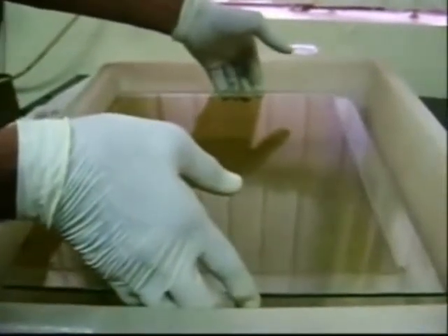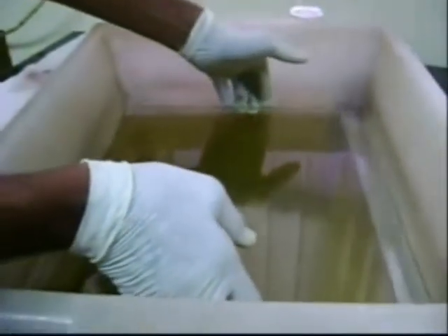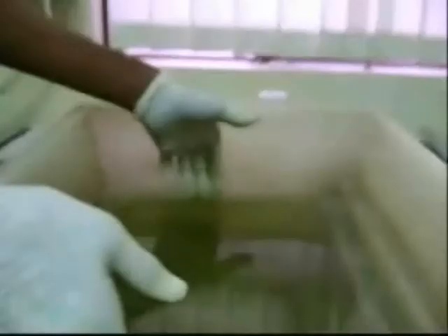Then keep the plate in fixer or stopper solution for 5 to 10 minutes. These are the banding patterns of SSR markers obtained after silver staining. SSR markers are used for population studies, individual genotyping, and construction of genetic maps.